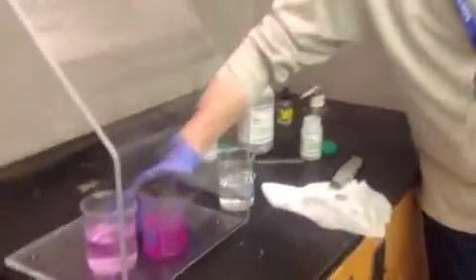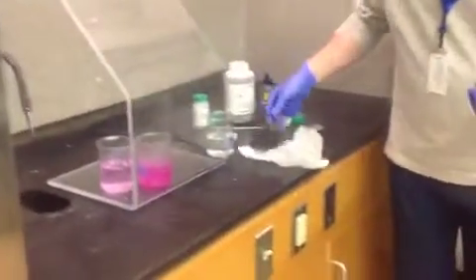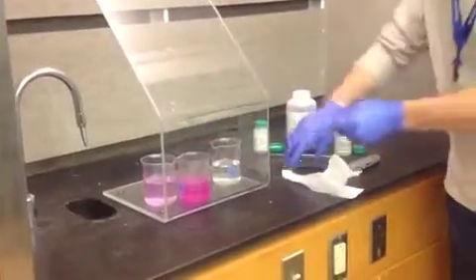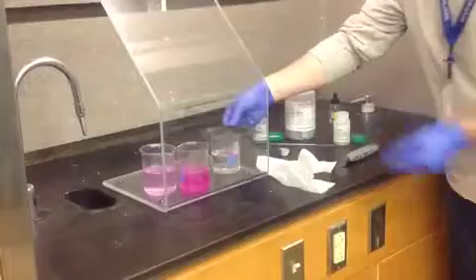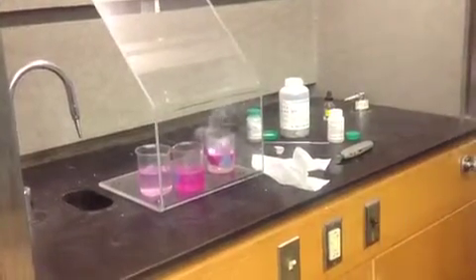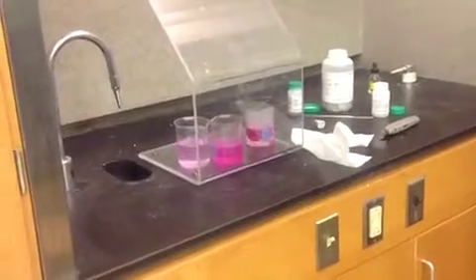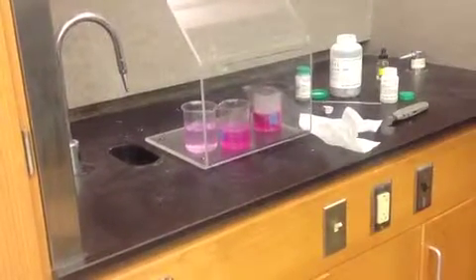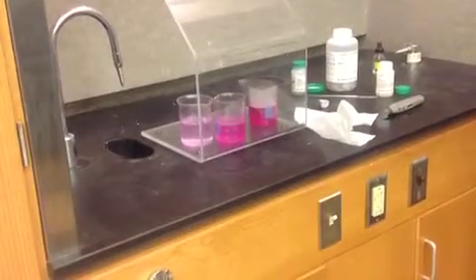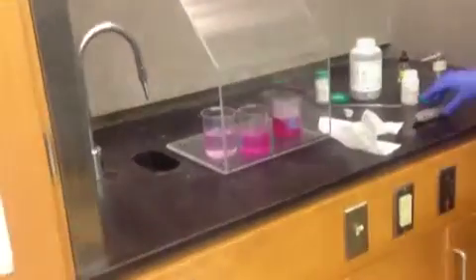But potassium has a special ability. Just this little tiny piece. Watch what happens when I put it in water. The hydrogen gas just caught fire. And you notice, did anybody see a little purple tint to that flame? Remember the flame test? The potassium was that purple color. So this caught fire right away.